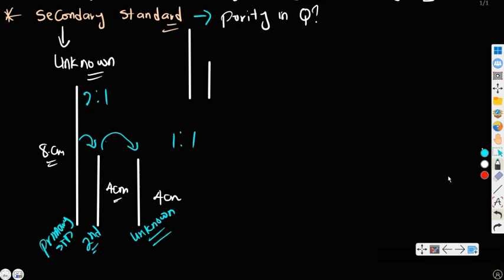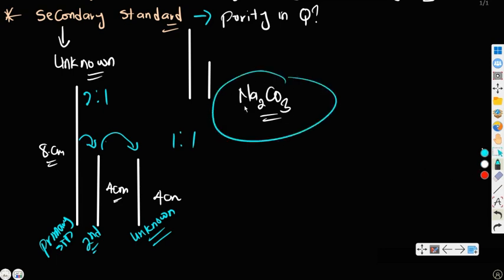Now, the primary standard that we know very well using titration experiments is sodium carbonate. Is sodium what? Sodium carbonate. But there are other primary standards. Most times, if they give you a primary standard, that means the concentration is accurately known, so your factor for that calculation will be how many? 1.